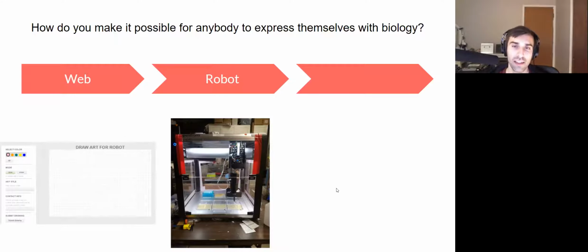GitHub is built for code, but it doesn't necessarily need to only be code. So some of our issues are things more like playing around with strains. And the idea is you do that communication through working on an issue, and then you push to that repository so everyone can see your work when you're done.